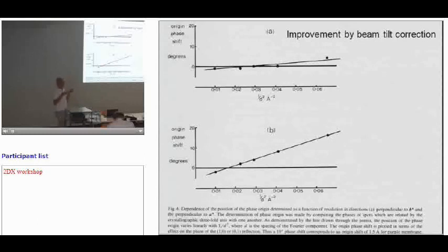And the reason was they didn't ask, could I be wrong? They assumed they were right. And that is partly happening in the single particle EM world at the moment with some of the papers. So what happened is we came along and we looked at the phases because we'd unbent them. We could see them, and they didn't agree at all.